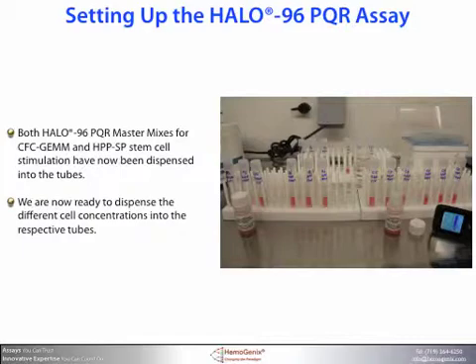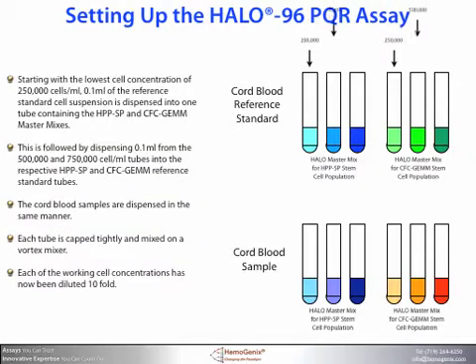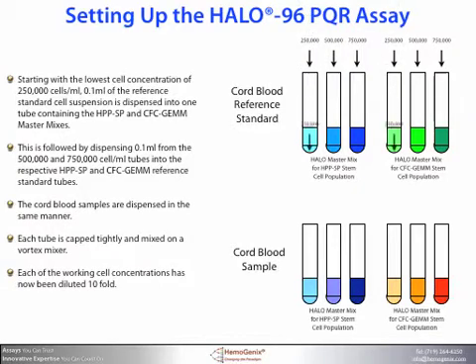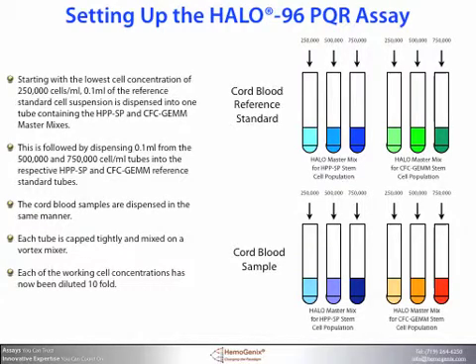Both HALO 96PQR master mixes for CFC-GEMM and HPP-SP stem cell stimulation have now been dispensed into the tubes. We're now ready to dispense the different cell concentrations into the respective tubes. Starting with the lowest cell concentration of 250,000 cells per milliliter, 0.1 milliliters of the reference standard cell suspension is dispensed into one tube containing the HPP-SP and CFC-GEMM master mixes. This is followed by dispensing 0.1 milliliters from the 500,000 and 750,000 cells per milliliter tubes into the respective HPP-SP and CFC-GEMM reference standard tubes. The cord blood samples are dispensed in the same manner. Each tube is capped tightly and mixed on a vortex mixer, and each of the working cell concentrations has now been diluted tenfold.